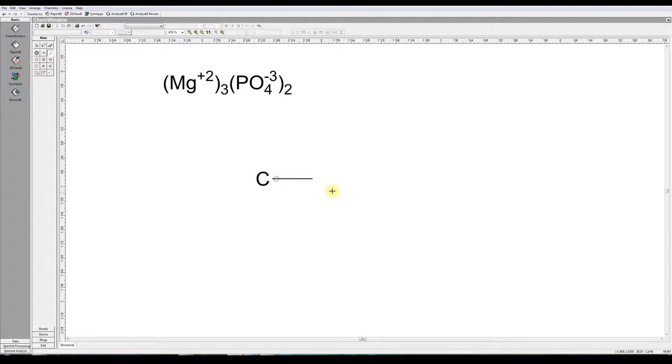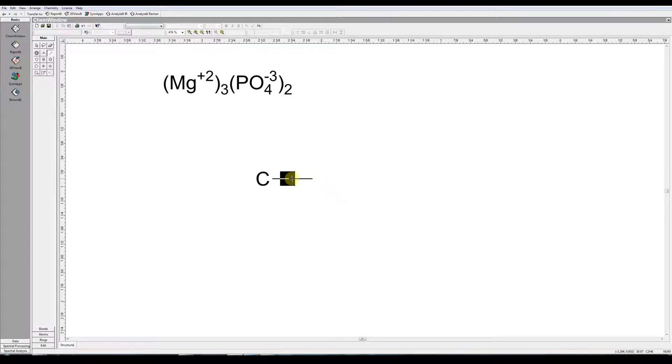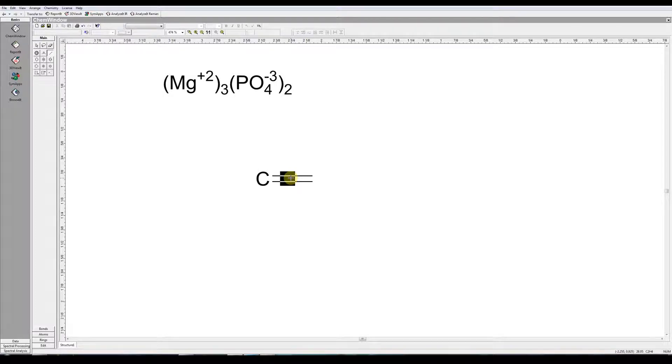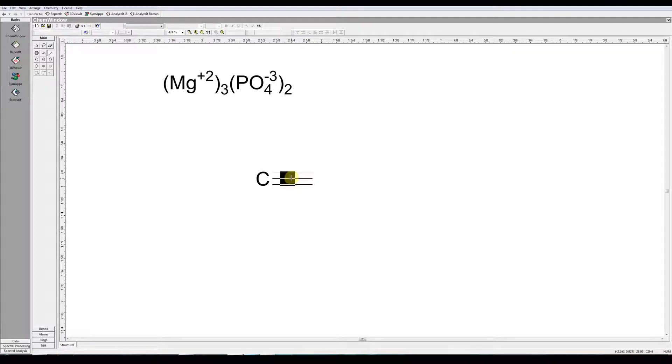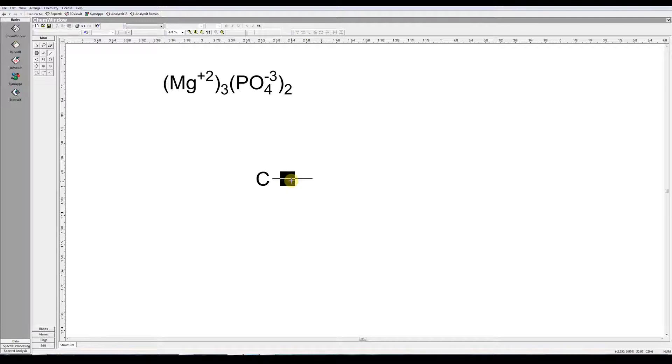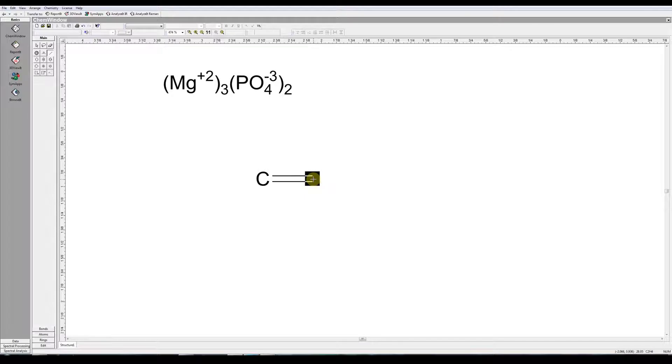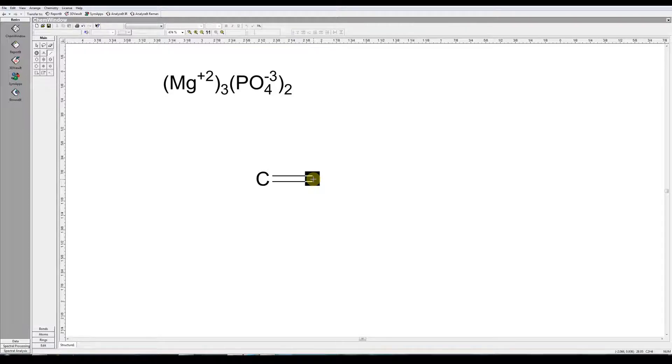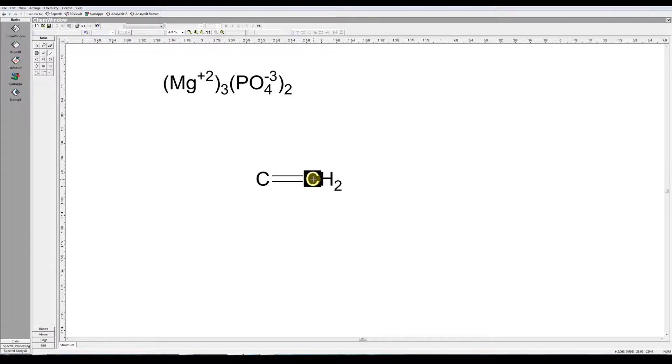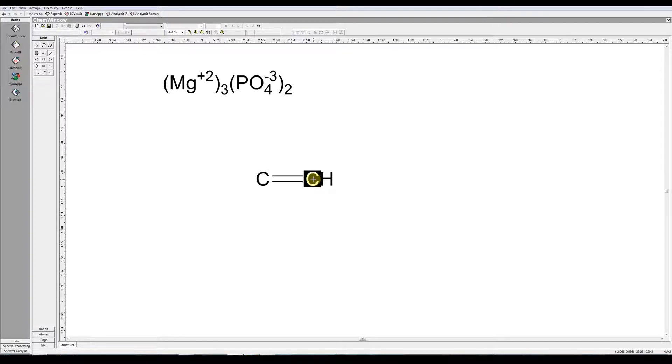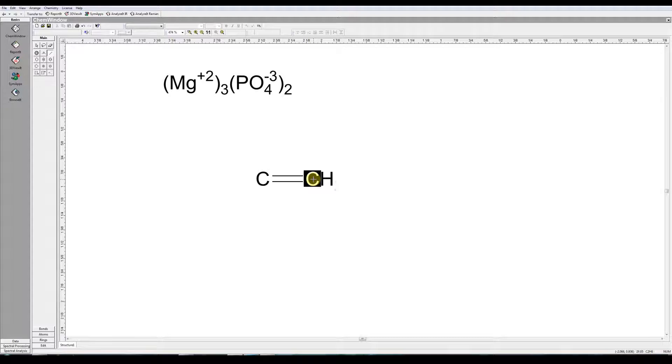So there's a carbon. And we want to make this a double bond. So hover your cursor somewhere over the center of the bond itself. And click and you get a double bond. If you click again, you get a double bond that's higher and a double bond lower. And eventually you get a triple bond and just keep clicking and come back to a single bond. But I'm going to go back to a double bond. Now if you bring your cursor over the end, the open end of the bond, you notice the hitbox appears. You can just type the letter C on the keyboard. And it adds a carbon with as many hydrogens as necessary to give carbon four bonds. If you don't want two hydrogens, you can click C again and it removes the hydrogen. So just keep hitting the C until you get as many hydrogens as you wish. Let's leave it as CH.